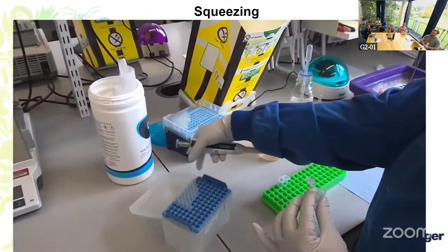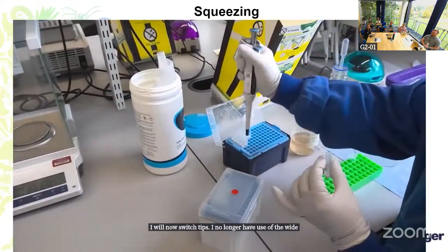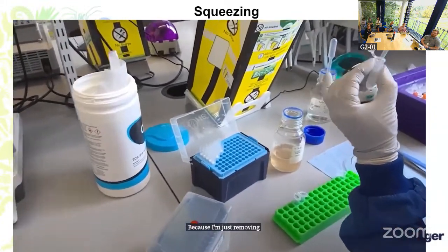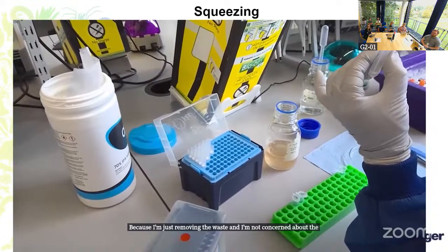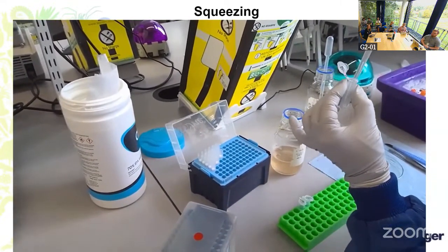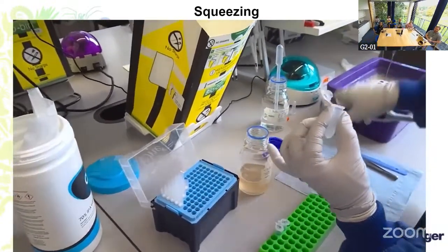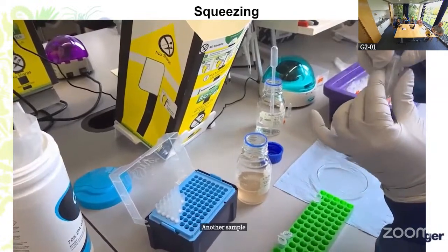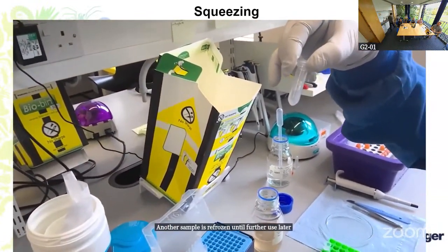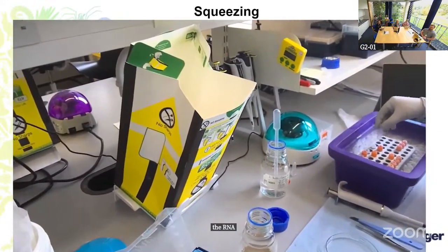I will now switch tips. I no longer have use of the wide bores. I can use a standard bore tip because I'm just removing the waste and I'm not concerned about the integrity of the sample at this point. The waste is removed. And now the sample is refrozen until further use later as either RNA extraction, DNA extraction, or Hi-C.